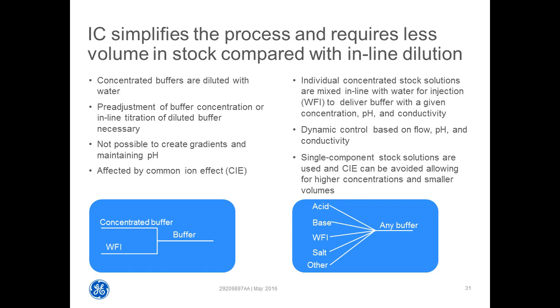Just to make things a little bit clearer, there are two different modes, if you will, or methodologies of creating buffers dynamically and on the fly. The simpler methodology is what is known as inline dilution, where you take concentrated buffers and dilute them just in time. The more intelligent, or more superior, methodology is inline conditioning, which is inline formulation of stock solutions, like we talked about, from the basic components.